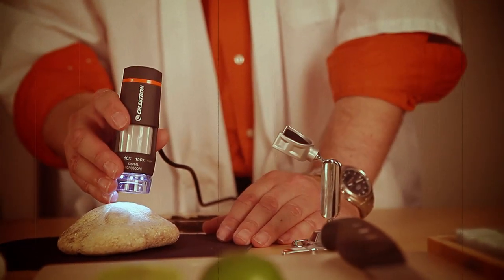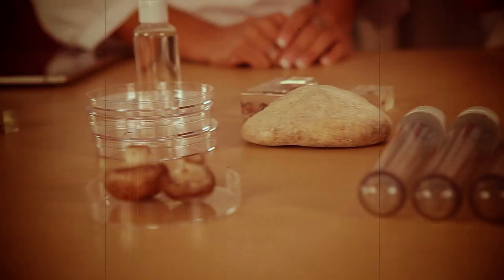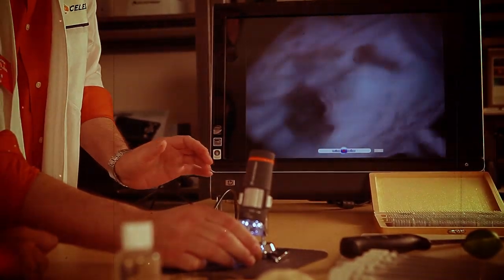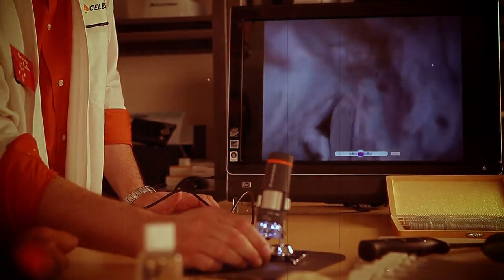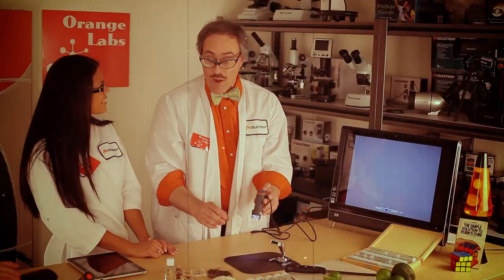This reminds me of something I had at Red Lobster yesterday. Let's check out this mushroom that I didn't eat for lunch. Look at that — you can see little membranes. I wonder what that part of the mushroom does. I'm not sure, but I bet it tastes good. It looked better on my dinner plate.